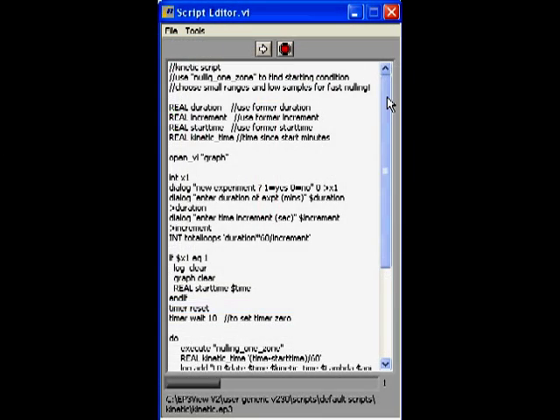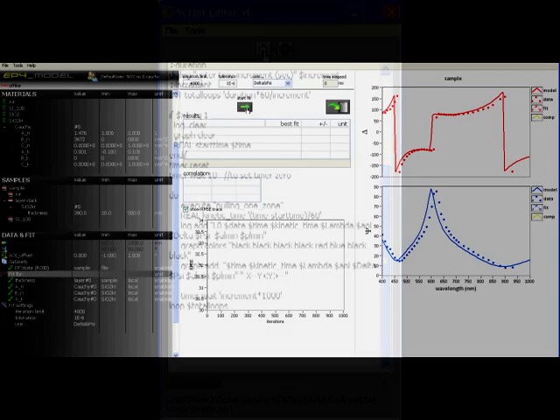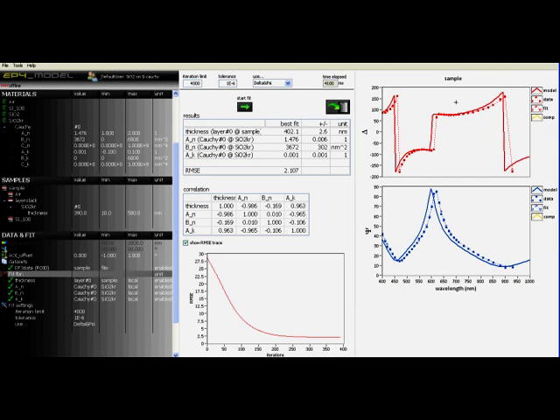With the software-owned scripting language, you may additionally automate your own measurement routines. The measured parameters are converted into layer thickness and optical properties of the material by means of optical modeling.